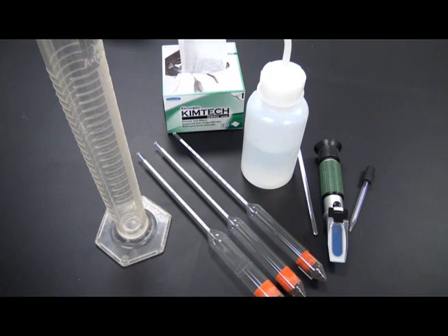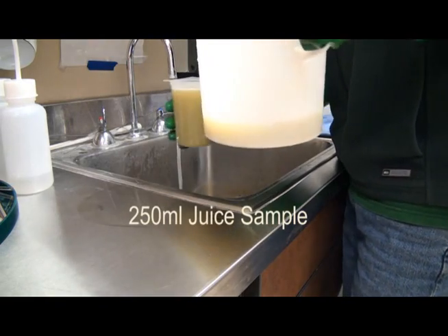The equipment needed to test Brix in juice with a hydrometer includes a hydrometer, a 250 ml graduated cylinder, and a 150 to 200 ml juice sample.